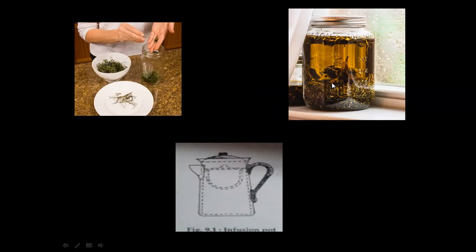Continuous or occasional stirring makes the extraction efficient, because the fresh menstruum present at the top has to go down, and the solution has to be diluted, so that the saturated bottom layer is displaced with fresh menstruum. To avoid this occasional stirring, we use the muslin bag. Here we take the raw material and place it into the muslin bag. Instead of immersing it completely at the bottom of the pot, we keep it just below the level of the menstruum.